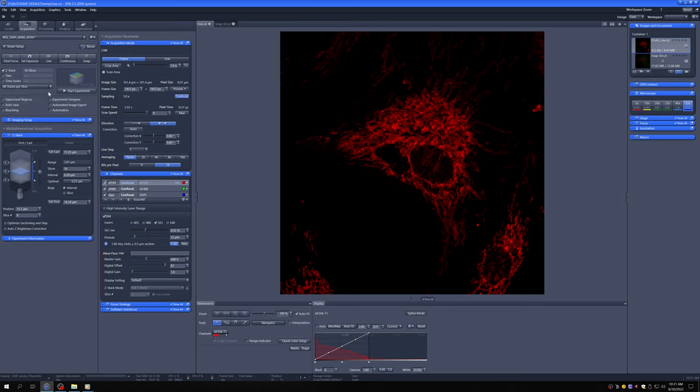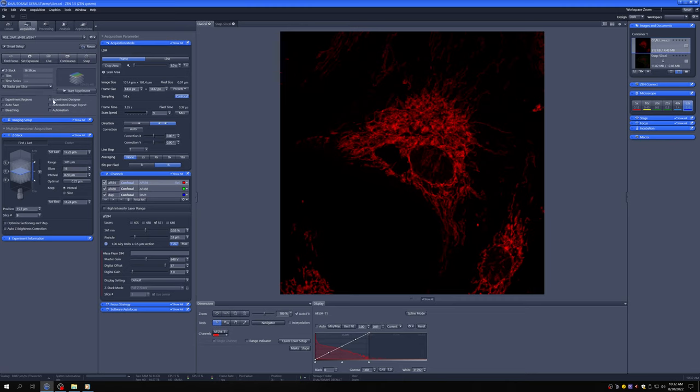So all tracks per slice does all of these things for each slice before moving on to the next one. If you have a three-channel setting, I would just do that. If you have a four-channel setting and you have a fixed sample, you may want to consider for speed to do a full Z-stack per track. That's going to be slightly faster. So let's go ahead and start the experiment.